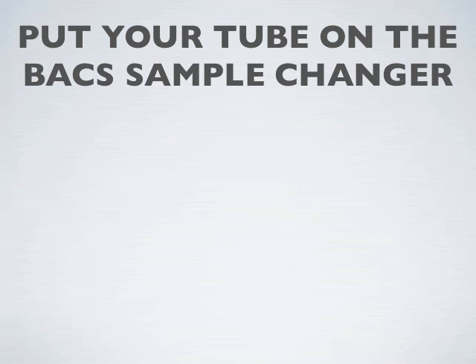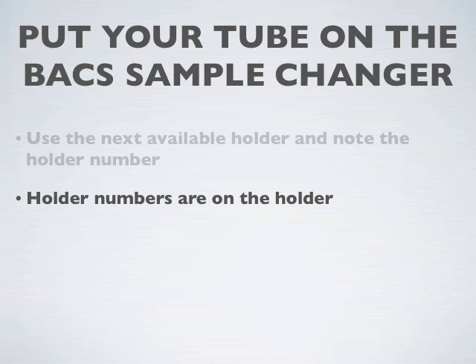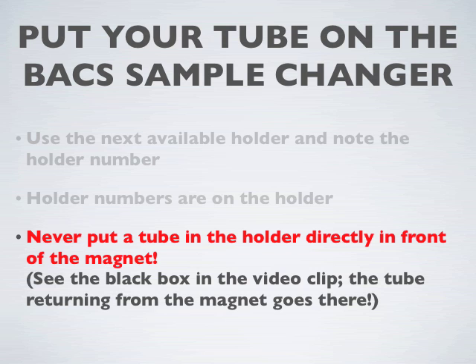Next, we'll put our tube onto the back sample changer. Note the number of the holder where you put the sample, and don't put anything in front of the black box in front of the magnet.